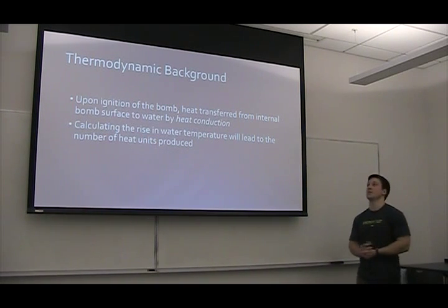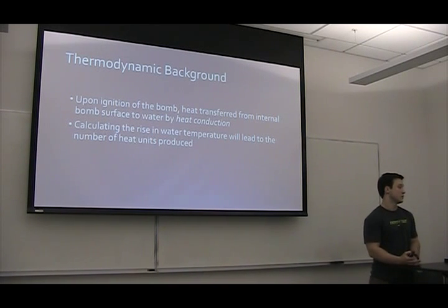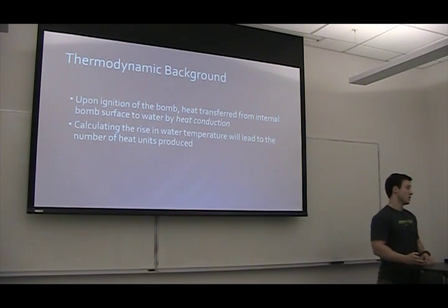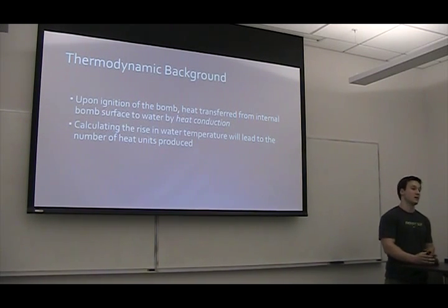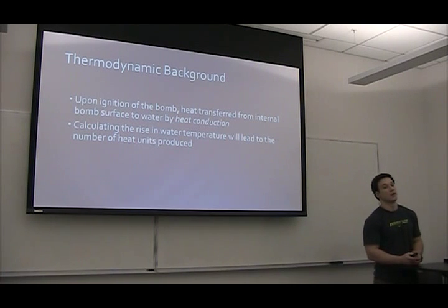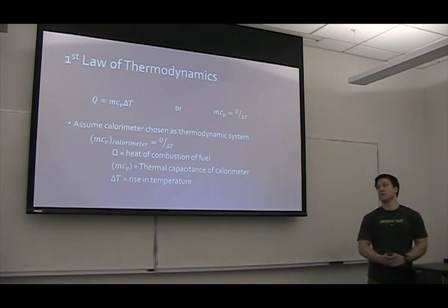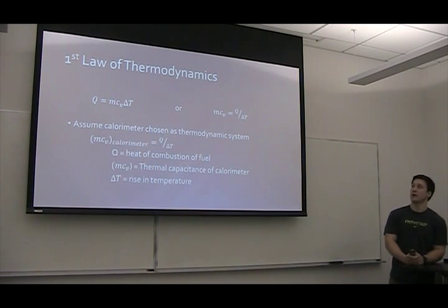So the thermodynamic background for this: upon ignition of the bomb, heat will be transferred from the internal bomb surface to the water by heat conduction. And we want to calculate the rise in the water temperature so that we can figure out the number of heat units produced from the explosion of the bomb.